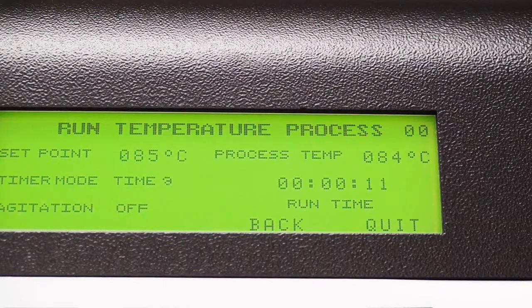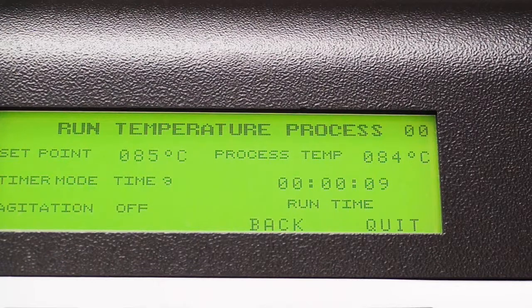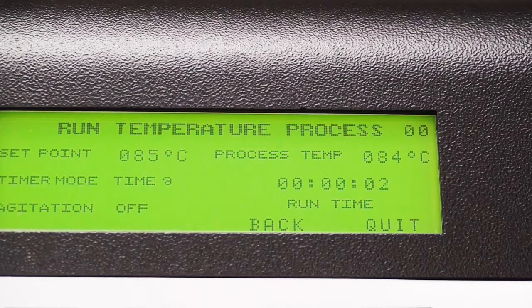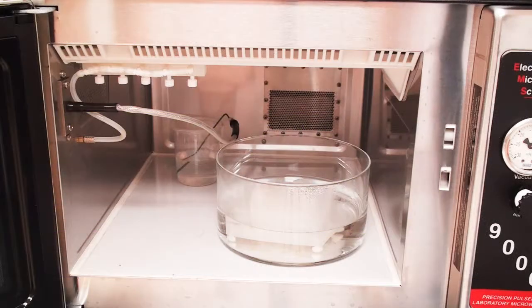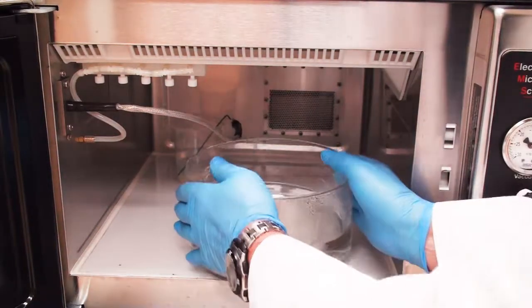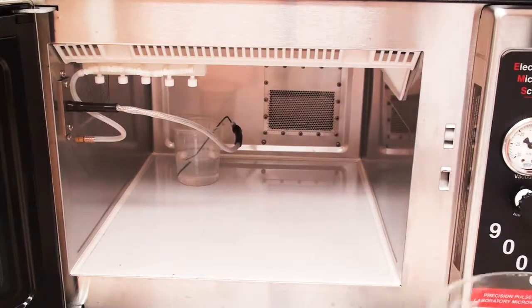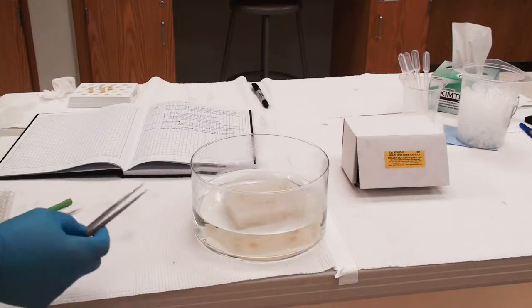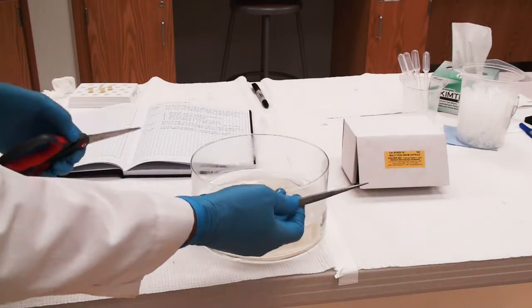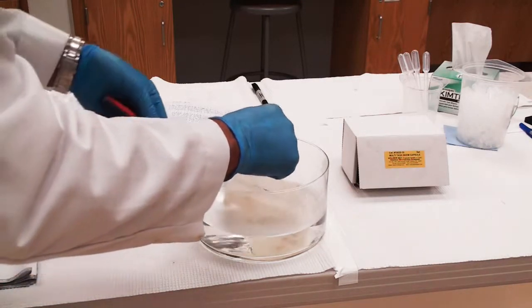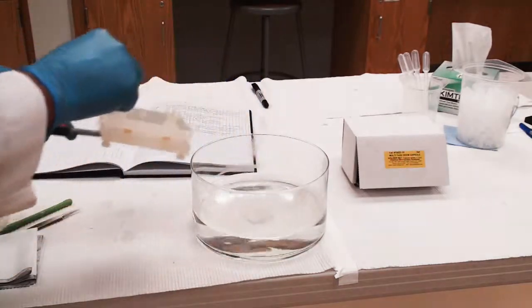And so now here we're down. It's been an hour and almost 45 minutes. We're all set, and I'm going to remove this and check on our polymerization. Now be careful, the water is hot at 85 degrees. All we have to do is take our unit out of the bath. I just have a pair of tweezers and then supporting that with a pair of scissors.